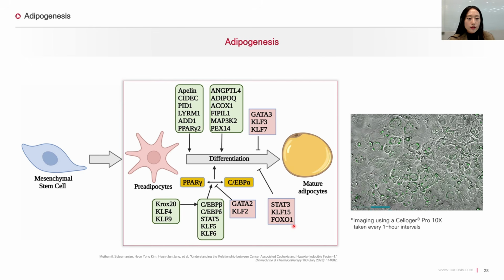However, adipocytes are highly sensitive to their environment. Factors such as temperature, CO2 concentration, and pH variability can significantly influence how well differentiation occurs. Even subtle differences in culture conditions or initial seeding density can lead to large variation in the degree of differentiation. That's why maintaining a stable and controlled culture environment is crucial.